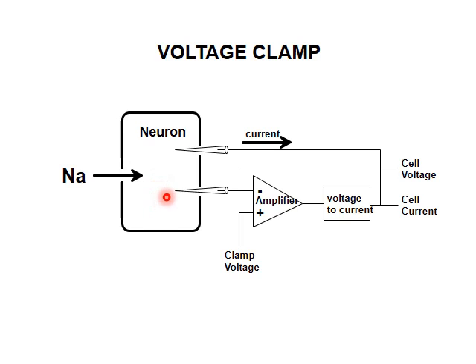Remember, we've clamped the cell at 0 millivolts, but sodium flowing in will try to raise the voltage above 0 millivolts. This amplifier, the electrode and amplifier, will sense this and immediately inject a negative current into the cell to just balance out the positive ion charge that's flowing in through the voltage-gated sodium channels.